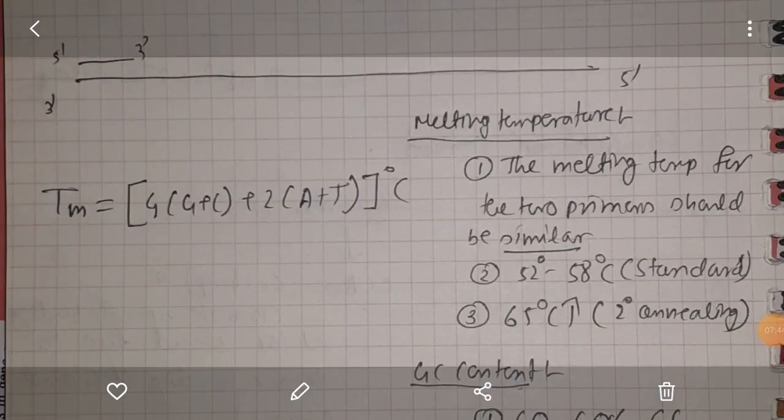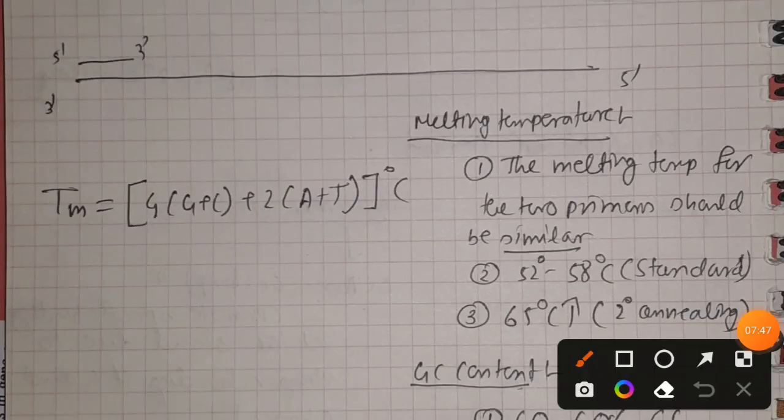According to the equation that I have taken, 4 out of 9 is quite a good term, because if we use the percentage, that means quite 44% was my GC content in the sequence that I had taken, right?